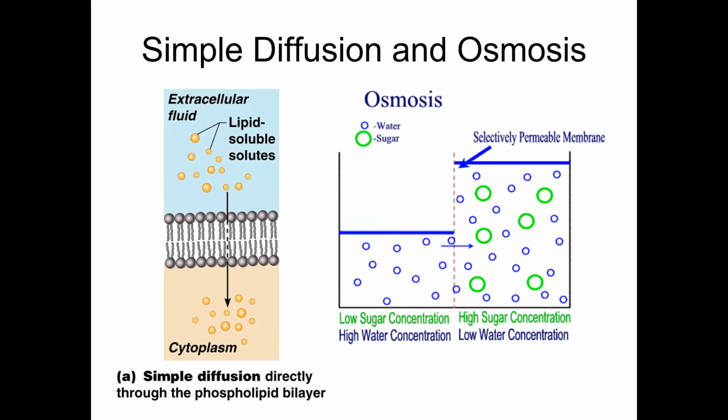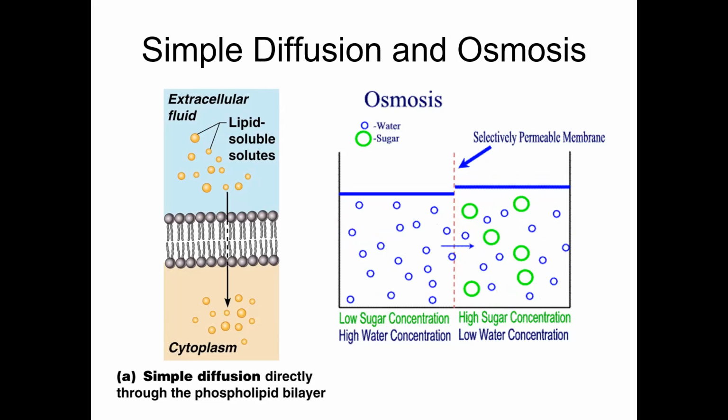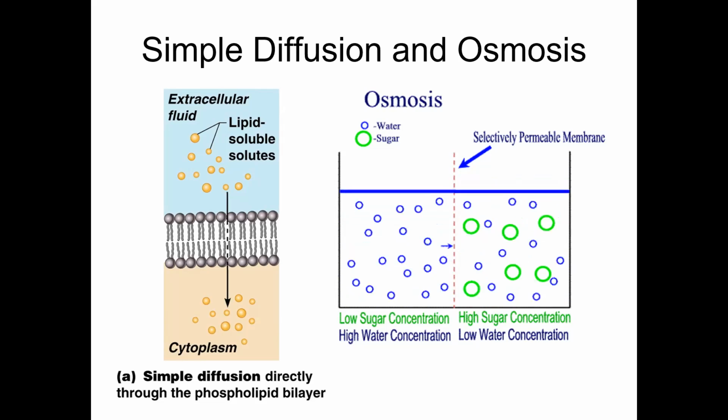I haven't done anything to those beakers. They've been sitting out here all morning. They're just salt water in one and distilled water in the other.